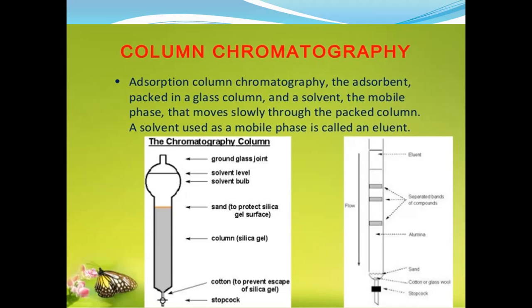Sometimes we don't add sand, but it is good to add sand. Why? To protect the silica gel surface. The sand will protect the silica gel surface. Sometimes our stationary phase may have reactive components, or it may undergo oxidation with air, or it may react with carbon dioxide.